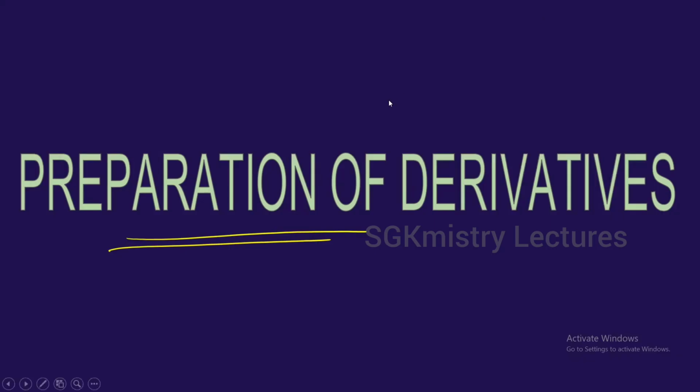First of all, we know that there are various compounds that are given to you, which are included in your syllabus. It can be resorcinol, urea, glucose, aniline, all these compounds. So I'll be taking up these important compounds, how to prepare the derivatives for each of these compounds, and what is the structure of the derivative for each of them.